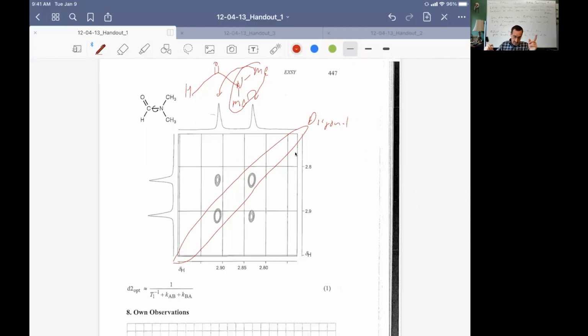You'd wonder if they are the same molecule. We saw these examples also in the homework problem that had the propionamide of benzyl ethylamine, where we had two sets of peaks. And the question was, why is this molecule giving two sets of peaks and why are they of unequal intensity?